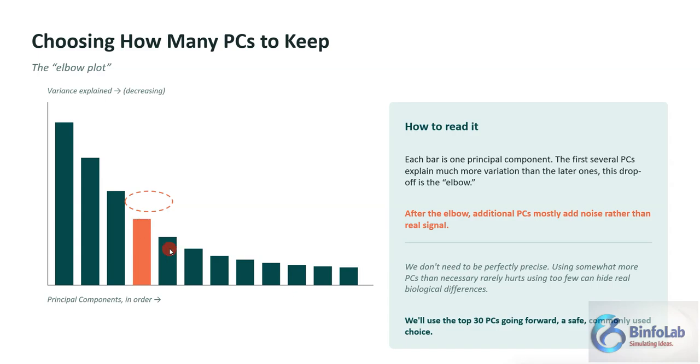The fourth and the fifth there is significance, but the fifth and the rest is almost a plateau line, not so much significant difference. Although there must be some differences, they are negligible as compared to the starting PCs. So if this is a real figure of your data, in this case I would suggest picking one, two, three, four PCs of the data and discarding the rest.